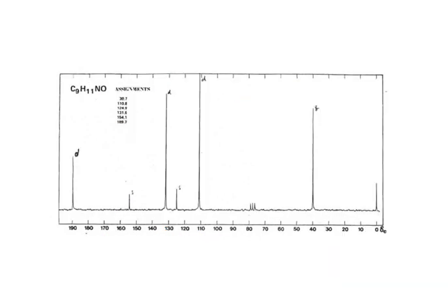Oh, maybe we talked about something else. All right. These are pretty old spectra. Look at how wide that deuterated chloroform is. It means it's at a low field.